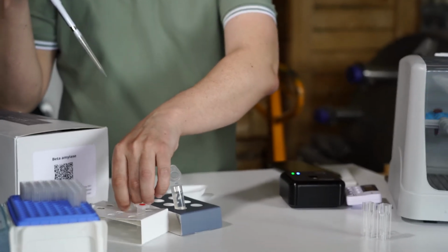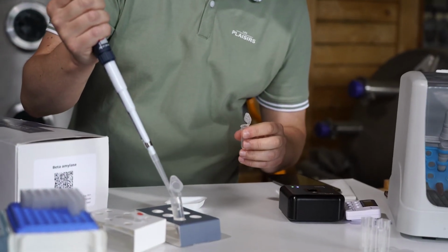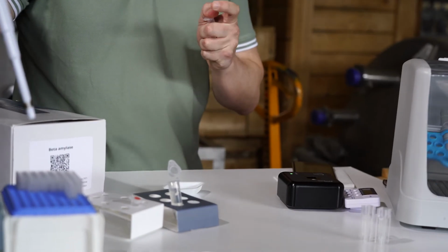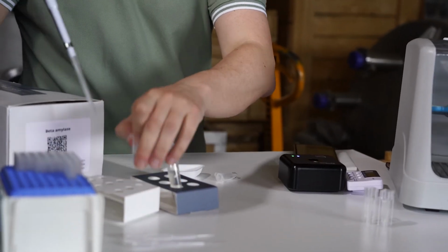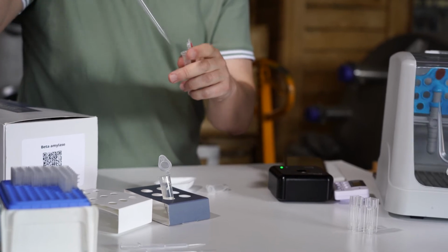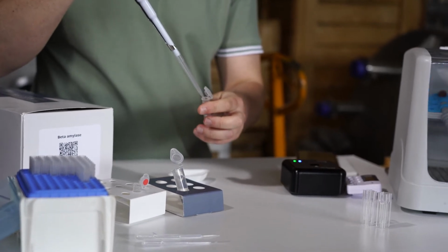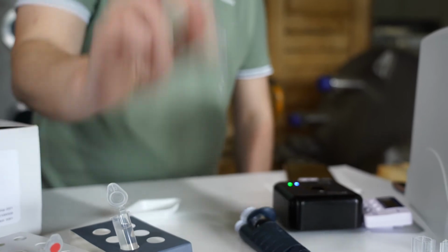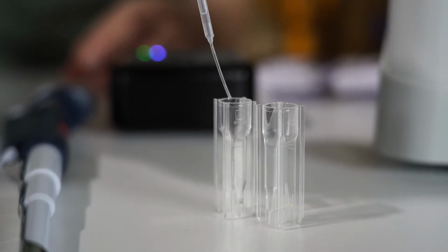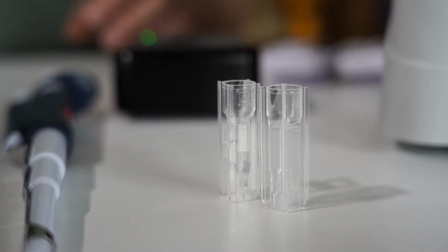So what we will do, we'll take the empty small transparent tube, and we'll place 250 microliters of the solution and 250 microliters of stopping reagent, which is signed with the red circle. So we're going to take 250 microliters of this and place it with the other liquid. You mix it for around 5 seconds to make sure that it's mixed. All you need to do is to transfer this mixture into one of the 2 cuvettes that you receive with the package.